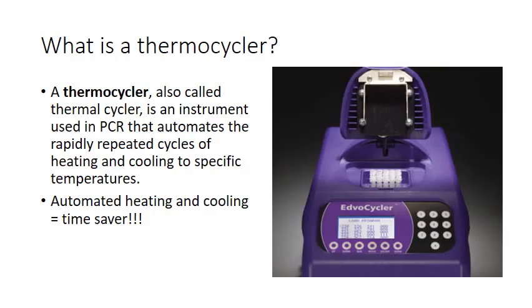Okay, so now we have a thermocycler. All right, a thermocycler. And this is a piece of equipment that cycles temperature. Thermo, temperature, cycler, cycle. All right, so this is going to cycle temperatures, going from hot to cold to hot, and it's going to do it really rapidly, just as if you had taken it out of a hot water bath on one side and put it into another one.